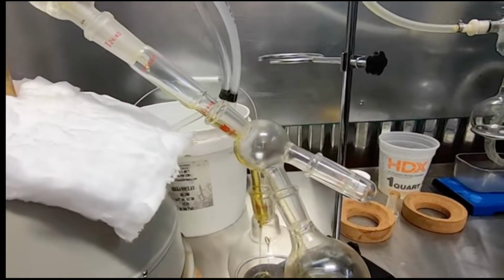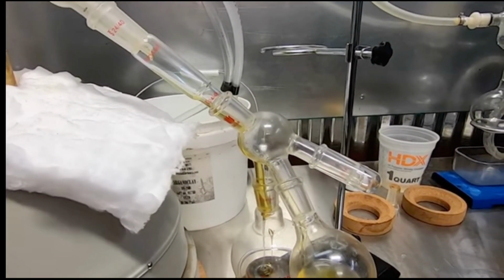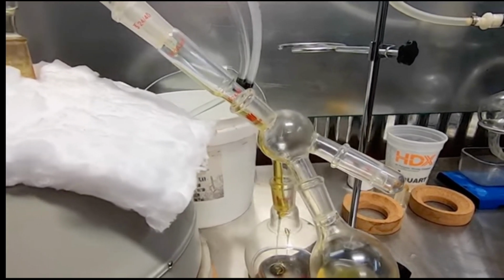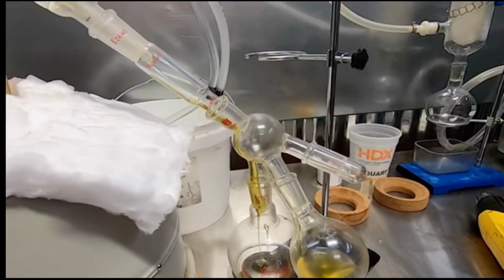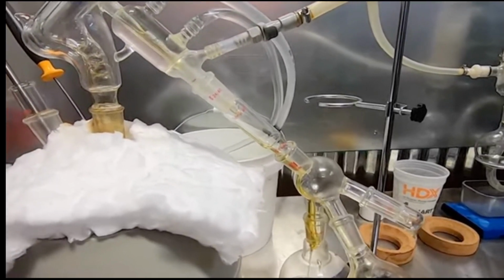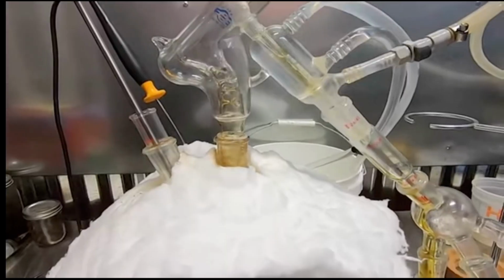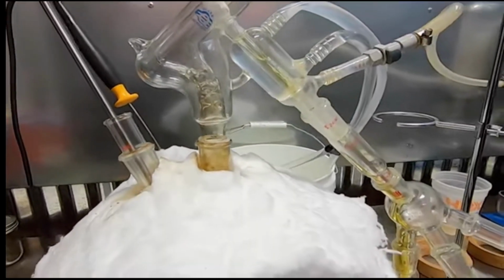The condenser cools the ensuing distillation vapors down, slowing their movement, initiating a molecular clustering of vapor and providing a surface for vapors to condense on. As vacuum pulls the distillation vapors through the condenser, the recirculated fluid absorbs the heat from the vapor, thus reducing its saturation capacity beyond the condensation point, resulting in the condensation of vapor into a liquid. The resulting liquid formed during the distillation process is referred to as distillate.